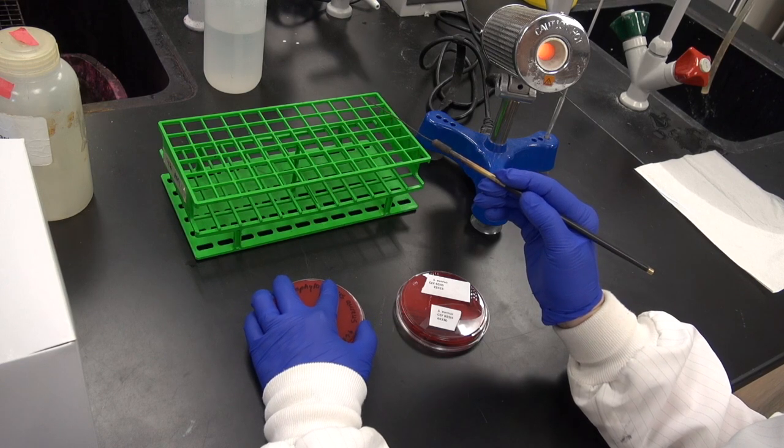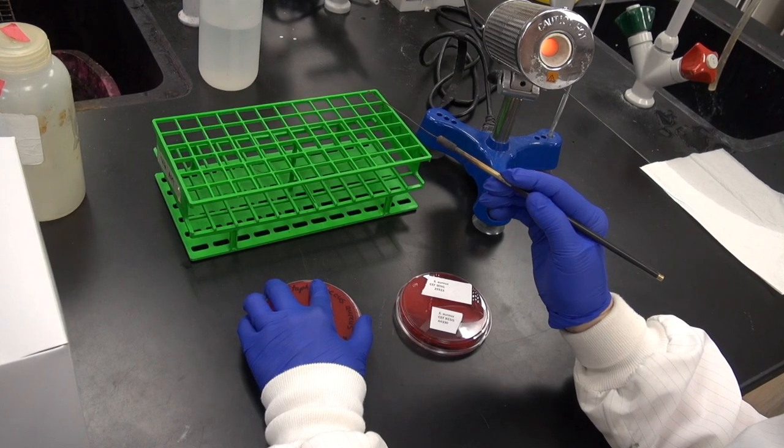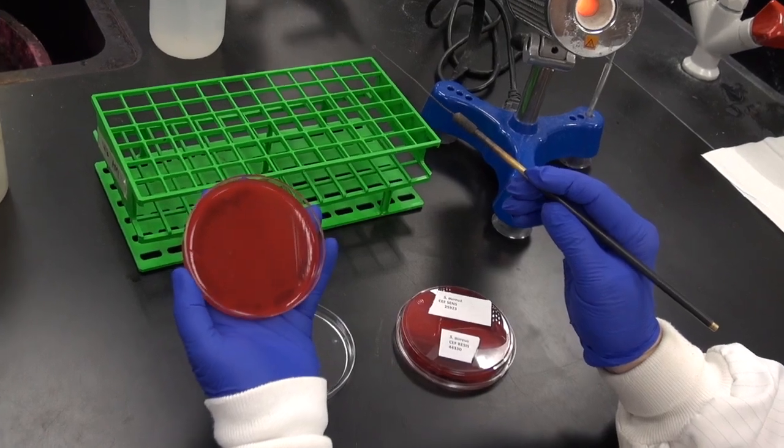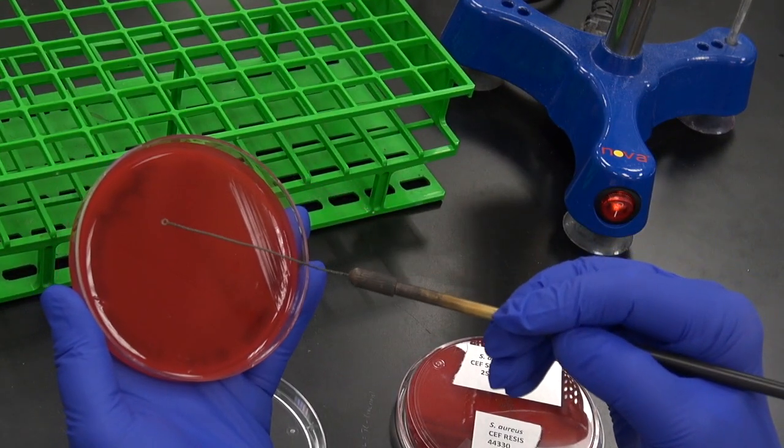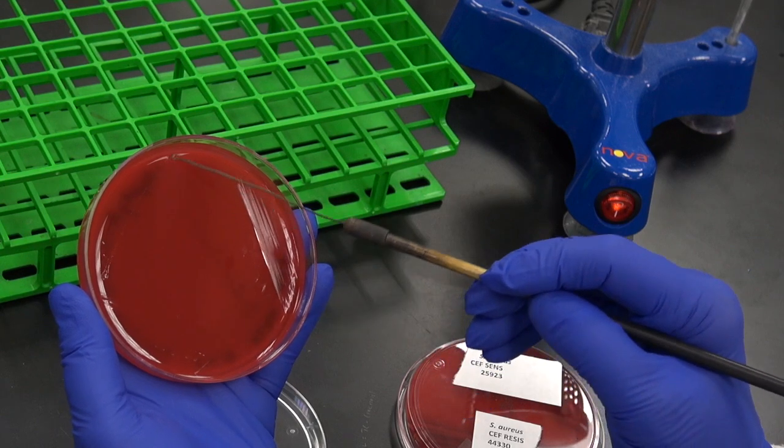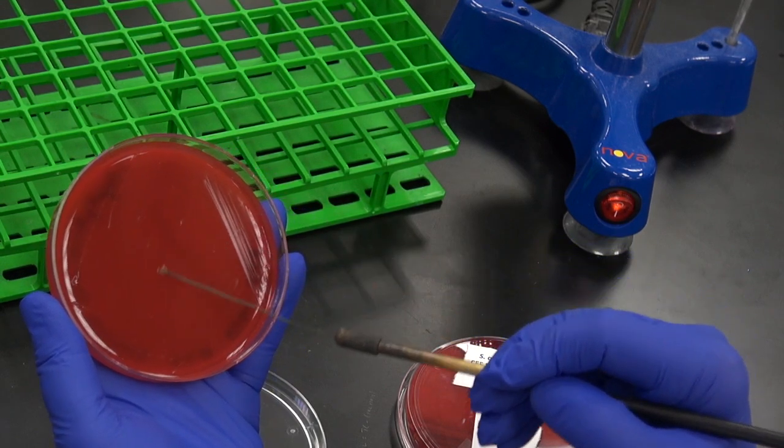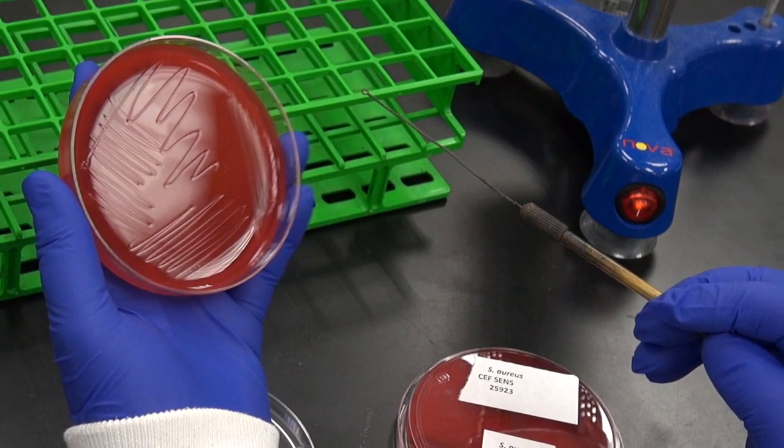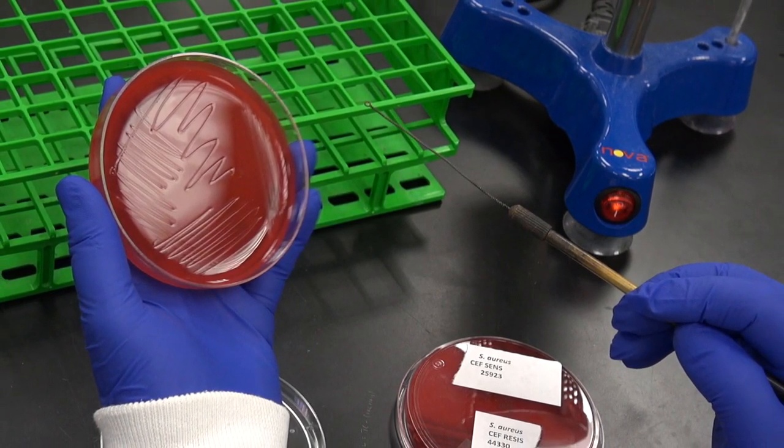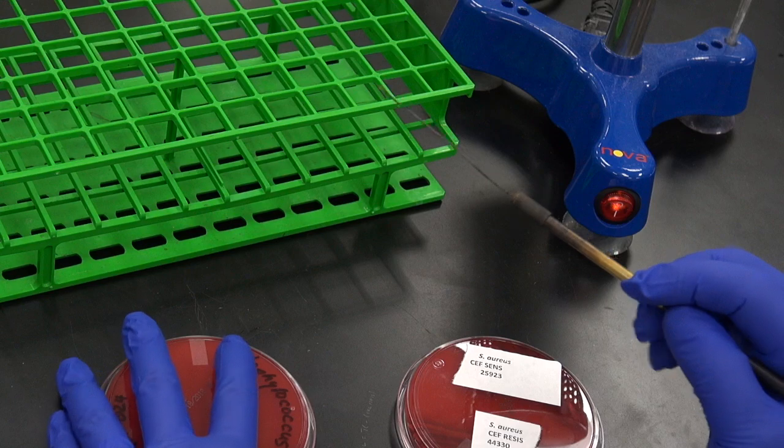Then open the plate and streak the fourth quadrant, using the same technique. Make sure not to cross into the primary quadrant at the end of the streak. Here you can see the streak pattern. Close your plate.